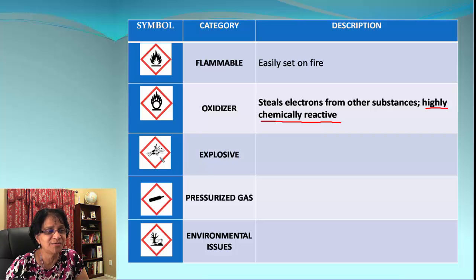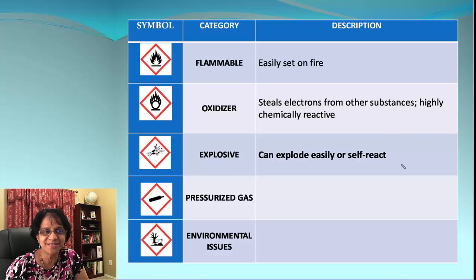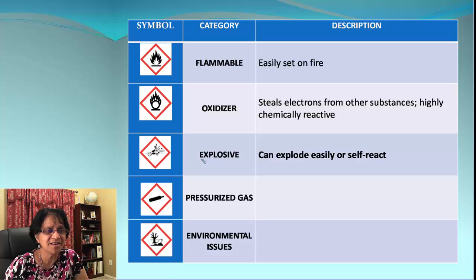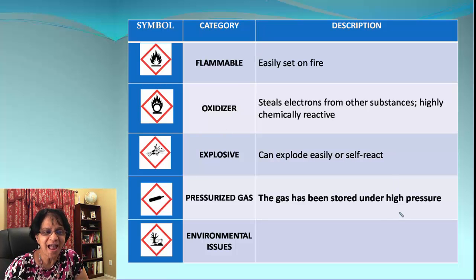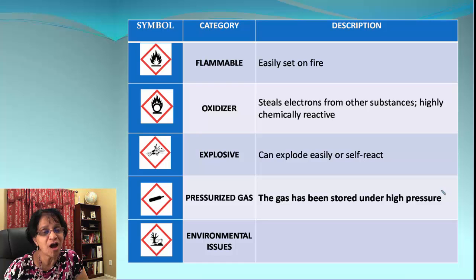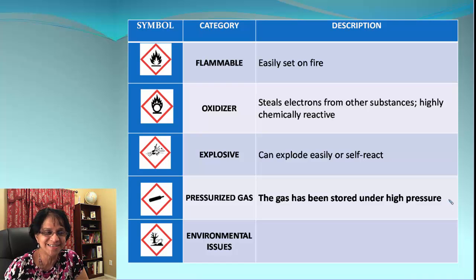Explosive — look at that firework in the GHS symbol. An explosive substance can explode easily and can even self-react on its own. Next is pressurized gas, shown as a cylinder with gas — that's the symbol. Gas is stored in cylinders under high pressure, so we have to be careful not to bring it close to any hot surfaces, and just be generally careful with pressurized gas.